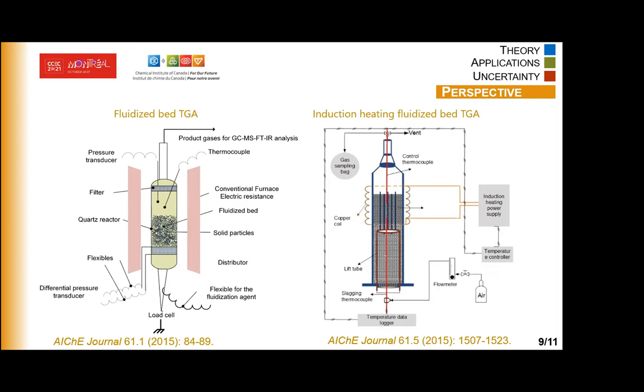Yes, really good question. In this fluidized bed TGA, you have your bed that you already measured. The whole bed will be set on a really precise balance. You measure the change of the weight with temperature and with changing of the fluidizing gas, so you know the effect of the fluidizing gas on your balance. And after that, you add your sample to the fluidized bed and measure the weight of the whole bed while heating up your sample and fluidizing it.